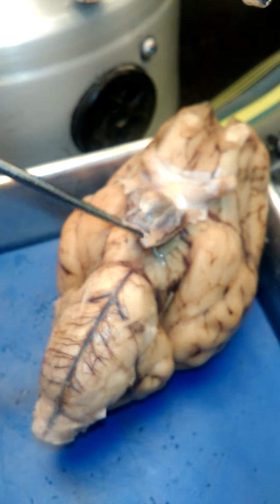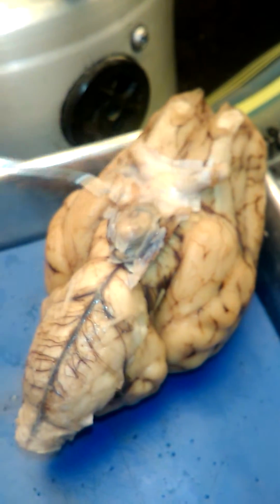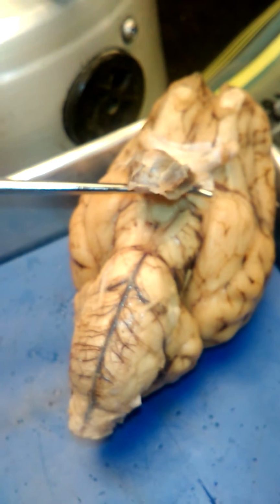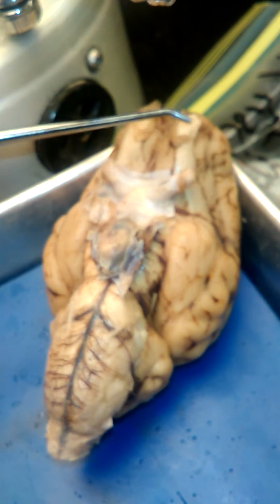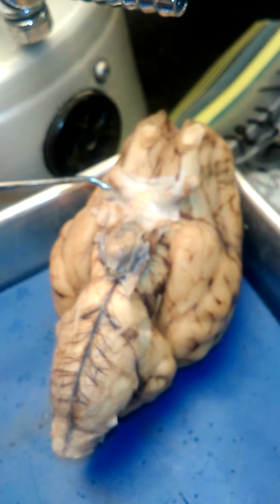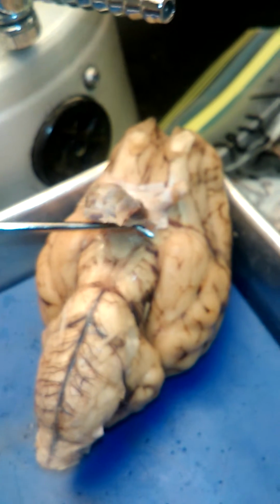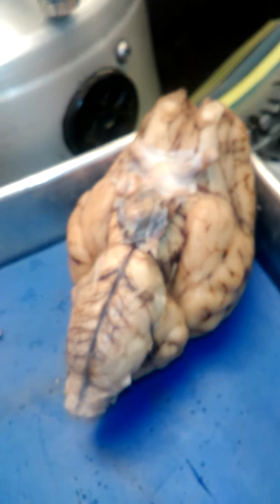I'm rubbing up against it right there. You see that? That is another nerve, and there's another one right alongside it, as you could see. Those are called the oculomotor nerves, okay? So here is the olfactory nerve, which is nerve 1. Nerve 2 is the optic nerve. When we raise up the pituitary gland, this is the third nerve, which is the oculomotor nerve, okay?